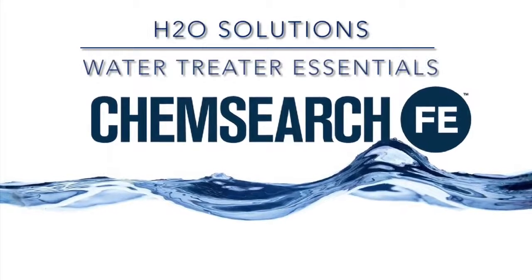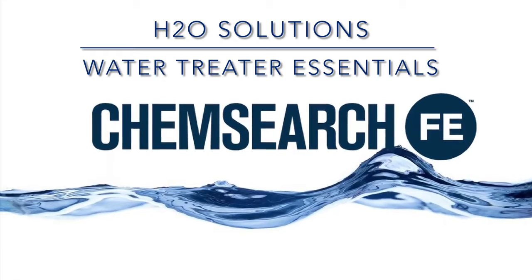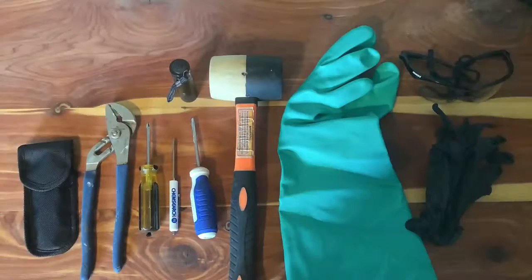In today's video, we will review some of the basic tools that all water treaters should have in the field, as well as a quick walkthrough of a water treater's test kit. Let's get started on some basic tools that should be with you at all times. Keep in mind that each customer will have a different need and necessary tools will vary from each job site.